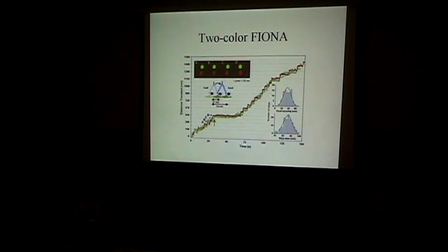but of different colors. Then if you measure the position of each foot as a function of time, you'll imagine that the green foot may move by 74 nanometers, followed by movement of the red foot. Okay? And that's what you see. You can see two dots moving, and they are occurring in a staggered manner. Fully expected from hand-over-hand, but it's still nice to see.